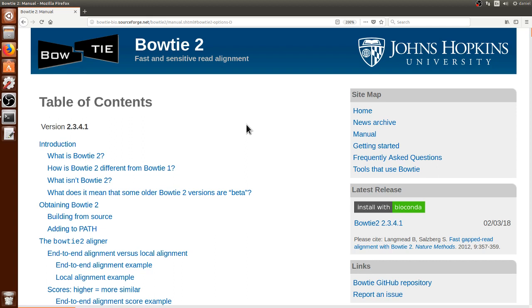Hi, my name is Daniel and in this video I will show you how to use the algorithm Bowtie2 to align short read sequencing data on a computer cluster using the terminal.